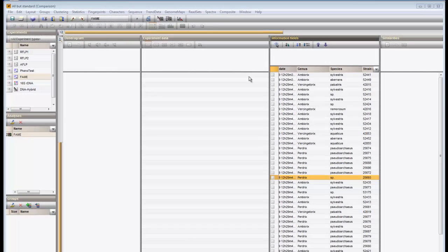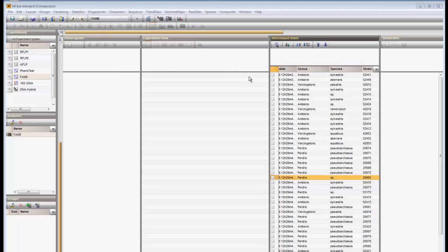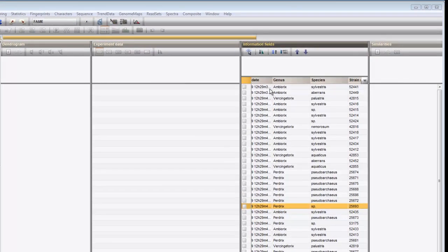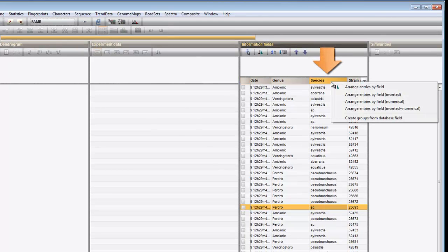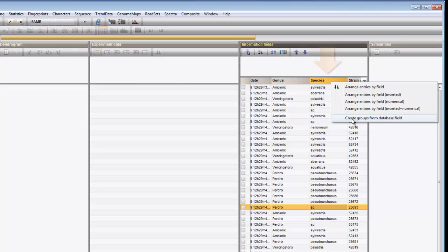We start from a comparison and select the experiment on which you want to calculate a PCA. For ease of interpretation, I will create comparison groups based on the species. I right-click in the heading and choose Create groups from database fields.